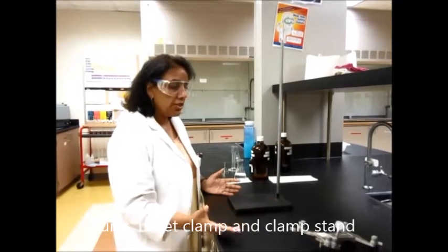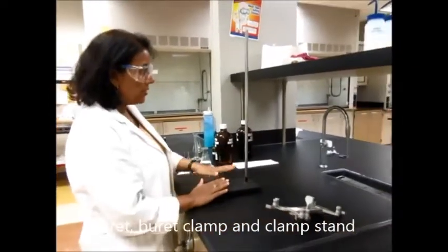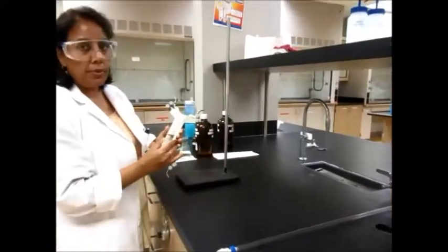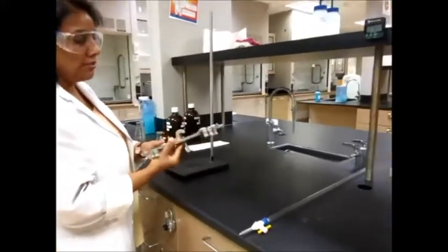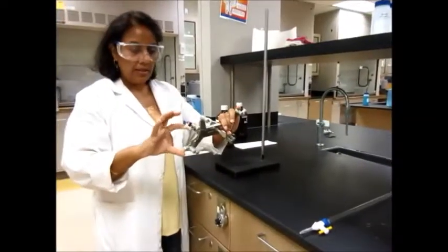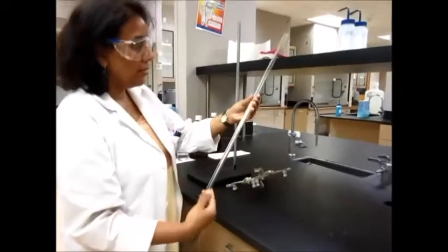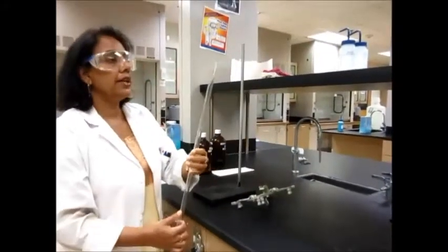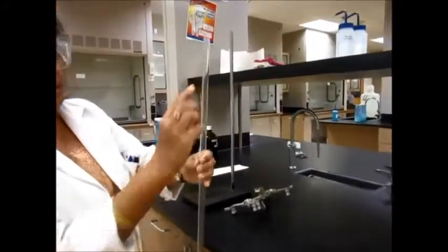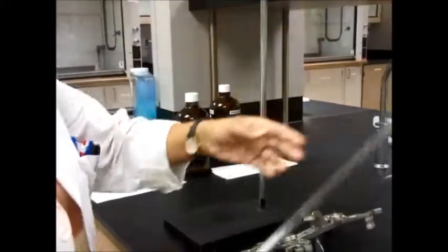In order to do a titration, you're going to need a burette, a burette clamp, and a clamp stand. Here is the clamp stand. Here is what we call a burette clamp, which is a little bit different from some of the other clamps you've used. This one has this little pinch clamp over here, and then of course here is the burette that you will need. The zero is at the top and 50 is at the bottom for reading the burette.